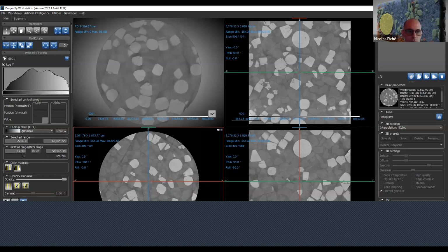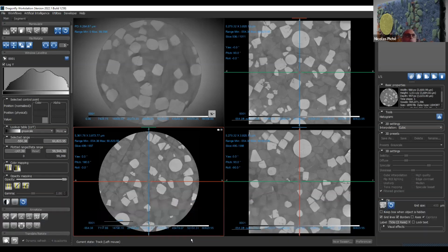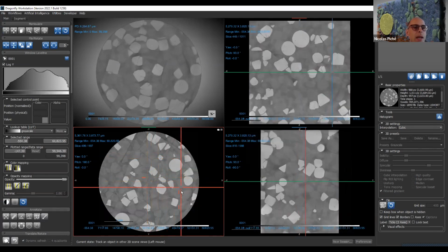And we have everything needed to be able to derive a series. The concept of derivation of series is the name they use in medical, but in fact, when I talk about deriving a series, it is creating a new data set from a different angle. Okay. So now we're okay with that. We know how to move around on screen like that. Here, those buttons, as you see, are action buttons. They are not state buttons. It's just for the current selected view.